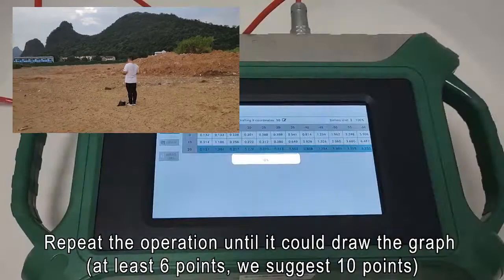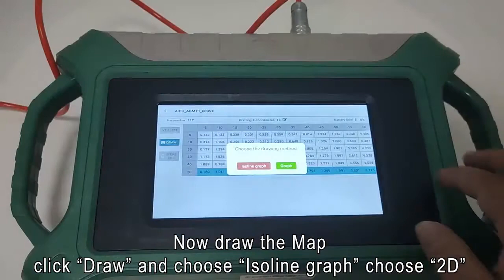Repeat the operation until it could draw the graph. At least 6 points. We suggest 10 points.